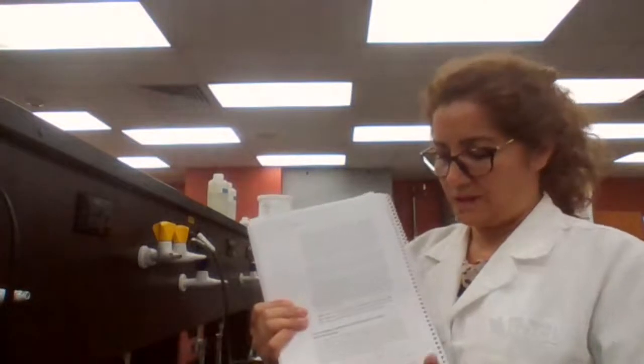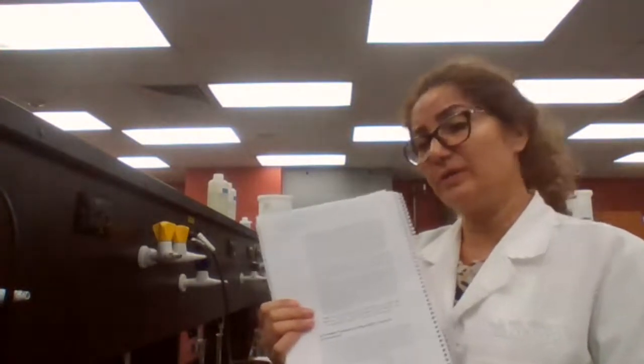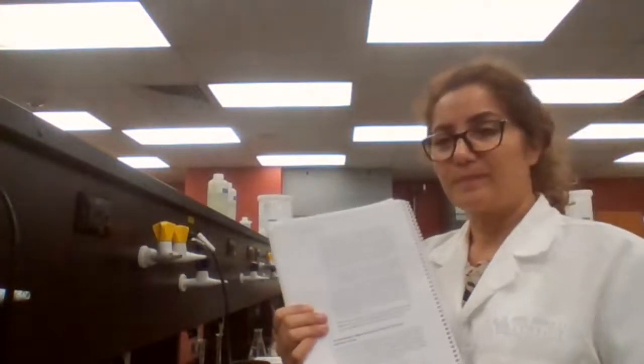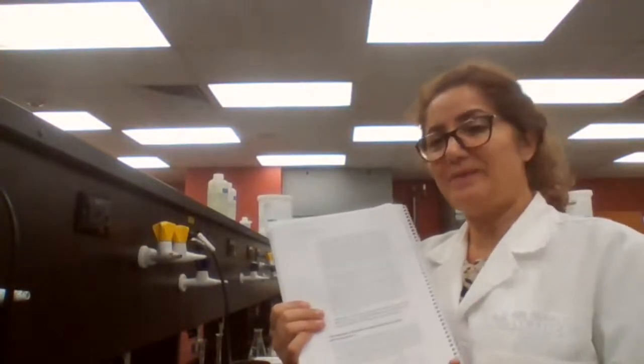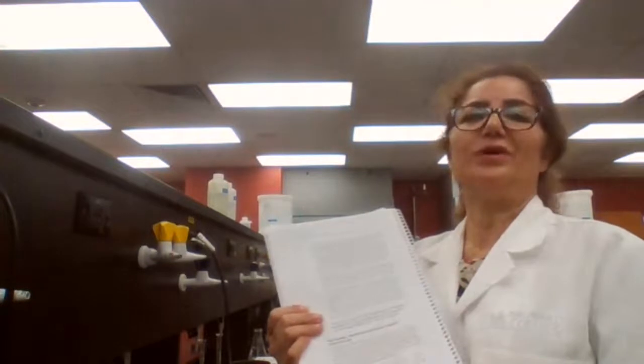What about the impurities? What should be the solubility characteristic of your solvent with respect to impurities? Because if the same thing happens to impurities, if impurities dissolve at high temperature but don't dissolve at low temperature, then you are going to get them back again, right?